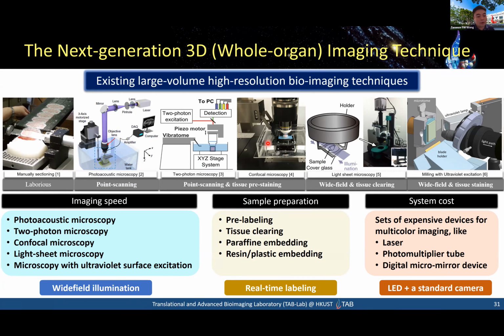One very common question that we ask is whether it's needed, and in practice, one application that we came across in some papers is that in 2D, because you can only examine a few slices, you may undersample the big features. From some slices, the cancer tissue size is not that big, and in deeper layers it may be bigger. If you miss the biggest layer of that cancer tissue, you may make a different call in surgical practice. So this is one application in that domain.